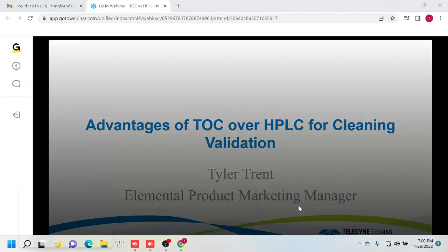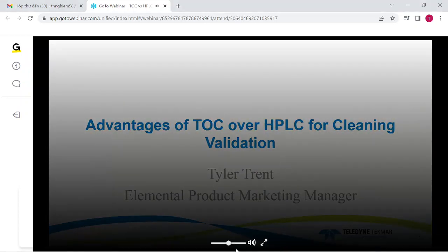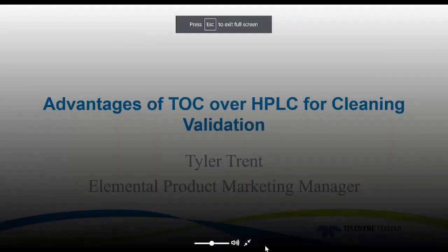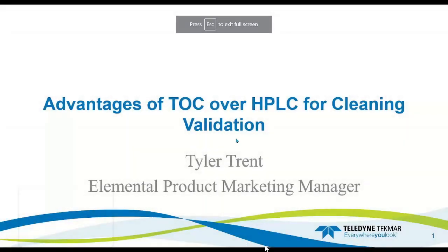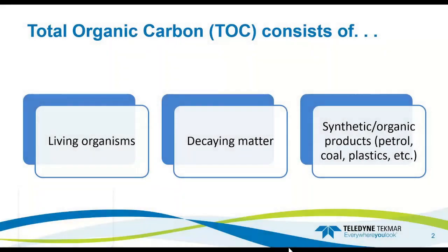As Shelley stated, today we're going to be going over the advantages of TOC compared to maybe some other techniques out there for cleaning validation, such as HPLC. So the first thing that we want to talk about is, what does TOC consist of? What is TOC for some that may not know?